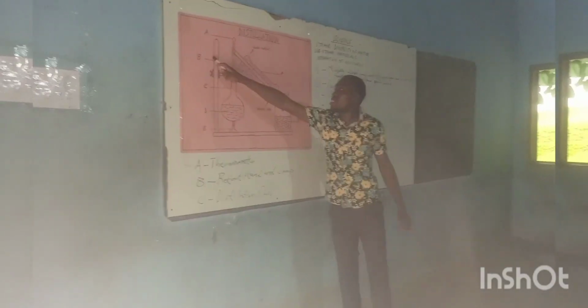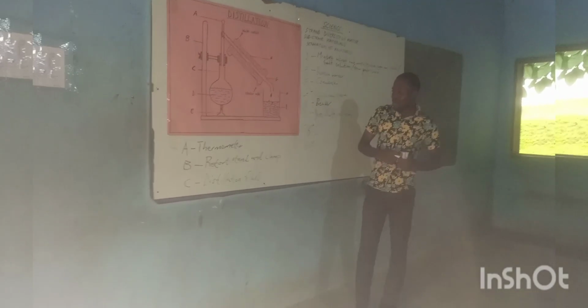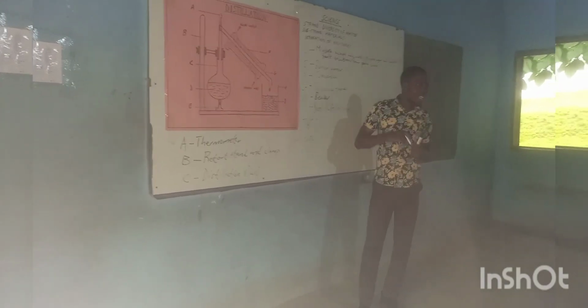Alright, retort stand and clamp. Do we use this one too on the field? No, sir. Okay. But what is the function over here? What is the function of the retort stand? Let's hurry.